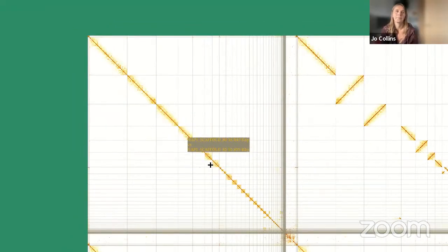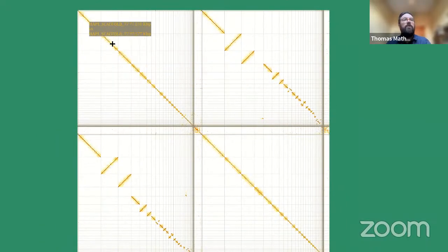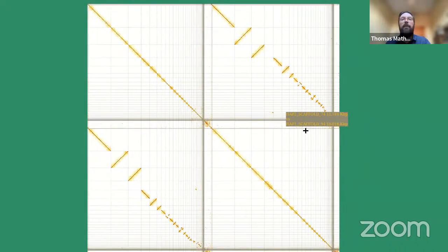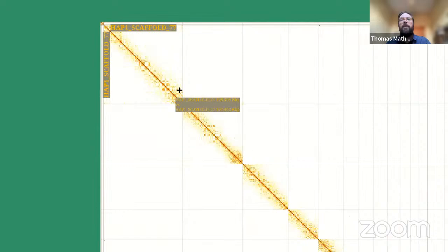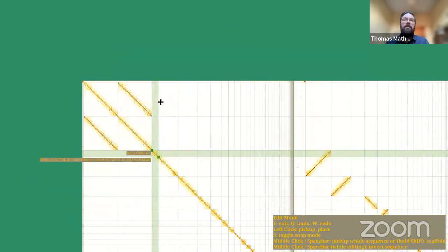Yeah. Okay, right. So what we've got here is the microfinder ordered map for this bird, and the first thing you notice is it's a phased assembly, and we've got both haplotypes included in the map for curation. So the first part of the map contains all the hap1 scaffolds, and then the second half of the map contains all the second haplotype scaffolds. These individual ones here correspond to large macrochromosomes. This is hap1, and then in the second haplotype, this is hap2.